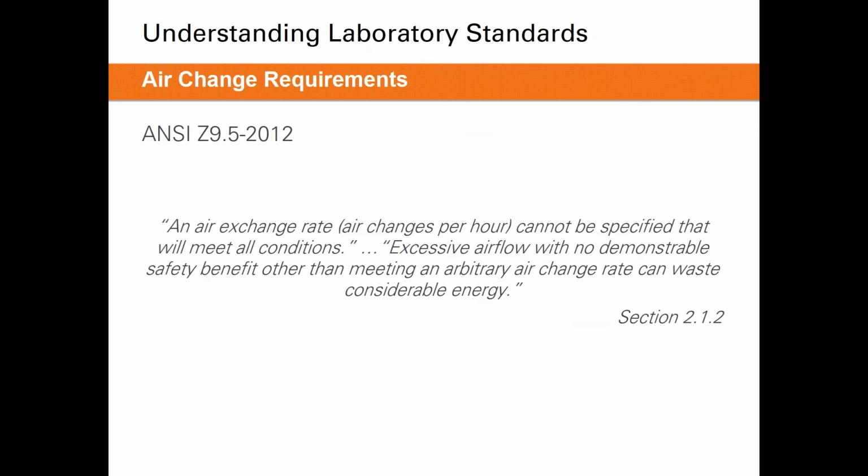ANSI Z9.5 also states something similar, that an air exchange rate cannot be specified that will meet all conditions. Excessive airflow with no demonstrable safety benefit other than meeting an arbitrary air change rate can waste considerable energy.